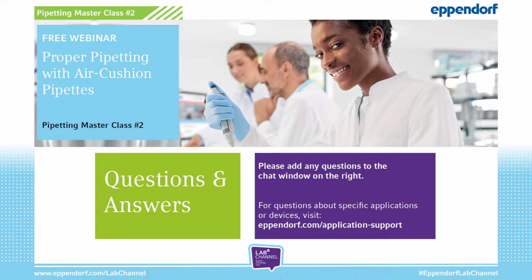When you're working more with water, that is the intended use primarily for air cushion pipettes. But as I mentioned already during the webinar, aggressive chemicals are not the purpose of air cushion pipettes, and they can harm the air cushion pipette. So here it is really recommended to clean and also calibrate the air cushion pipette more than once a year, as it is stated in the ISO.